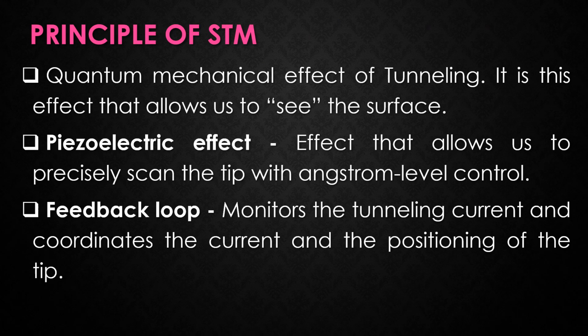Next are the principles of STM. The STM is based on several principles. One is the quantum mechanical effect of tunneling. It is the effect that allows us to see the surface. Another principle is the piezoelectric effect. It is the effect that allows us to precisely scan the tip with angstrom level control. And lastly, a feedback loop is required, which monitors the tunneling current and coordinates the current and the positioning of the tip.